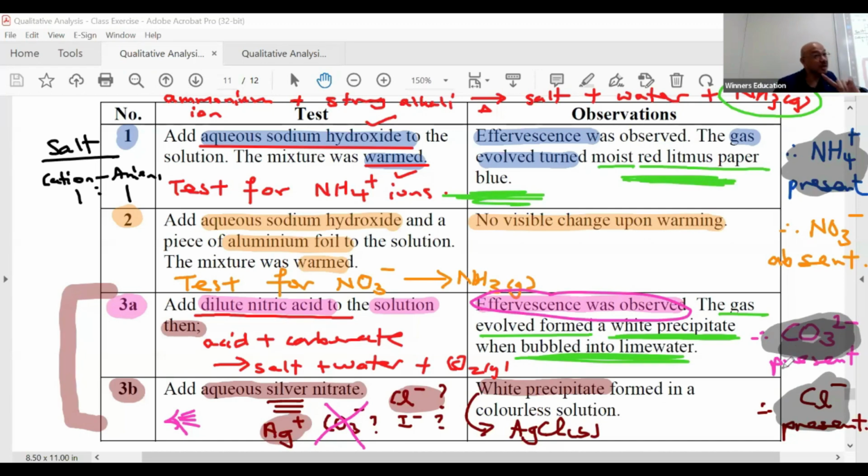This is important because if I ask you, can you predict what this substance is based on the current situation? Can you say something for me? All right, so you test. Say I'm drinking it, and inside are these three ions, which you have confirmed already. What possible information can you share with me? What do you think I'm drinking? So there are a few possible identities.